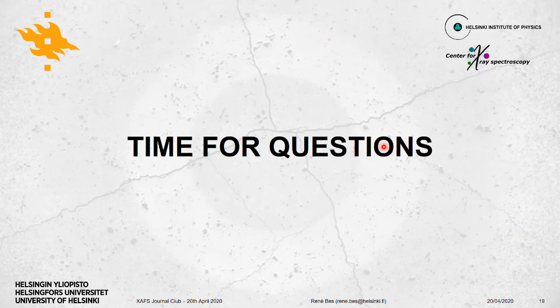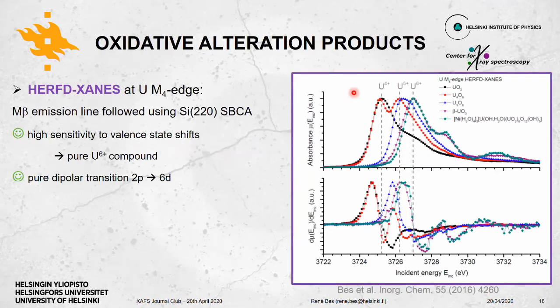I was saying we're going to wait just a minute for questions, but I had a question for the M-edge HERFD. I thought it was lovely data. I wondered if you could just tell us about the spectrometer and how air absorption was dealt with. Oh yeah, so the spectrometer was a half-meter von Hamos type spectrometer.